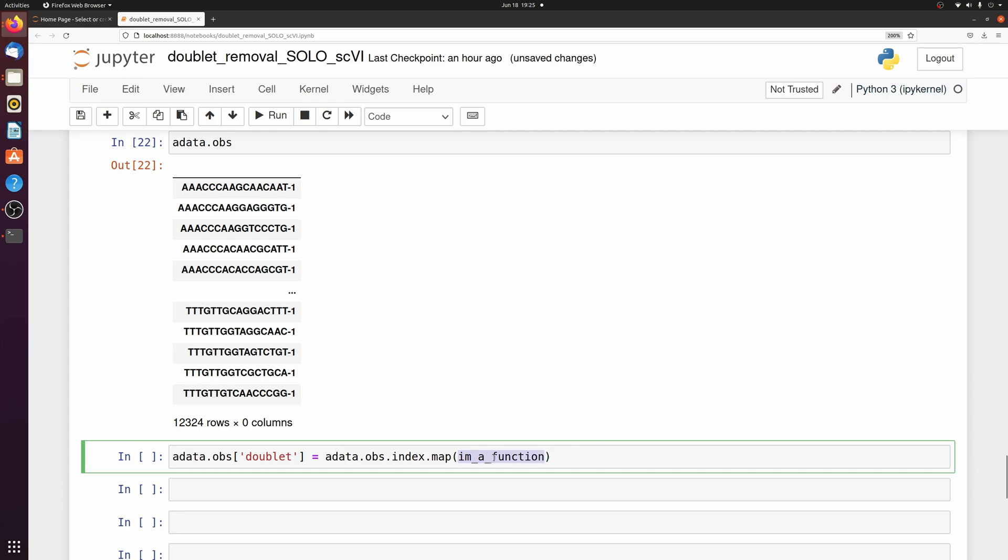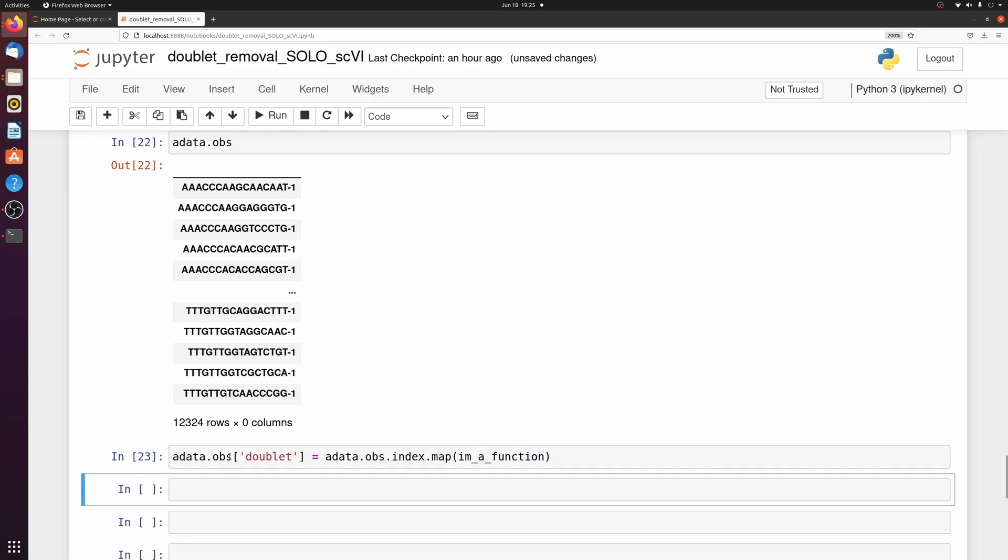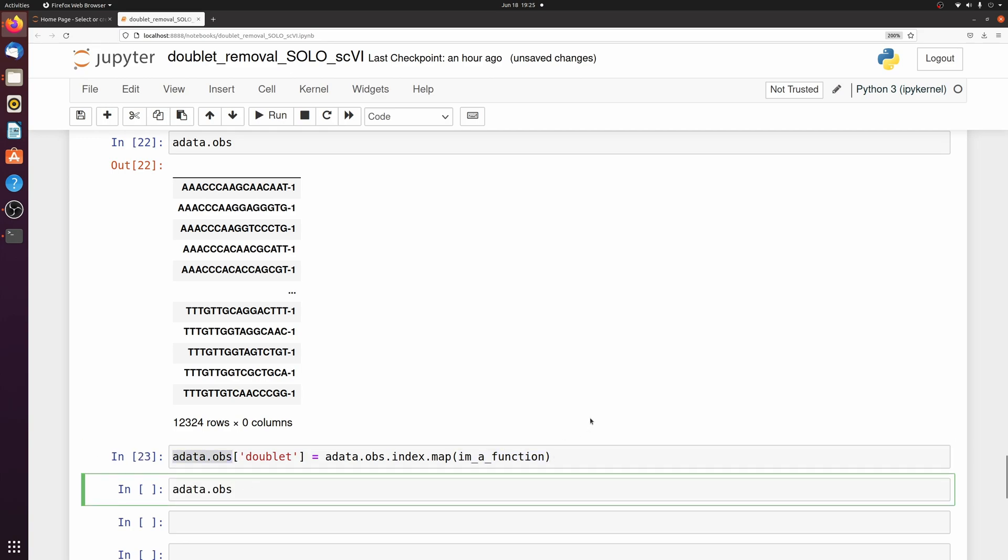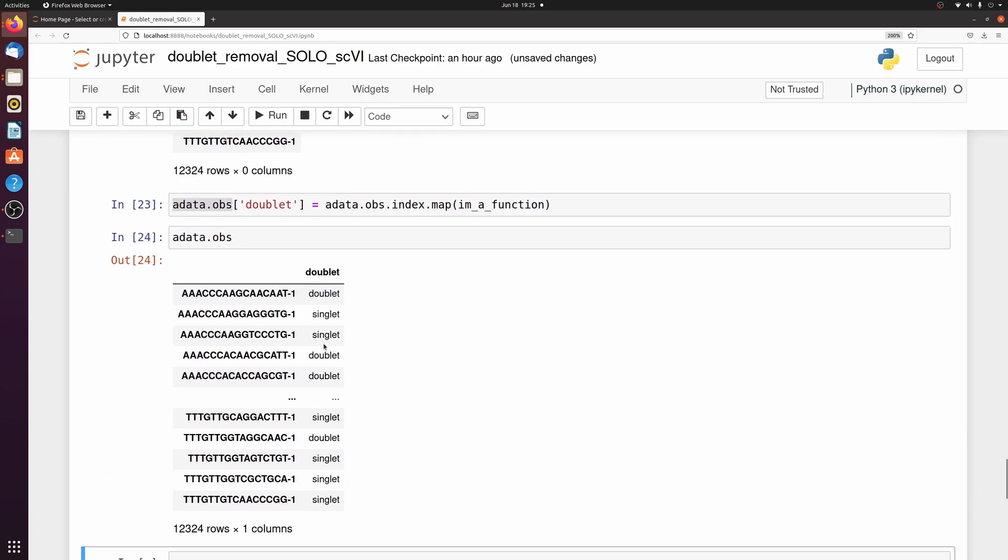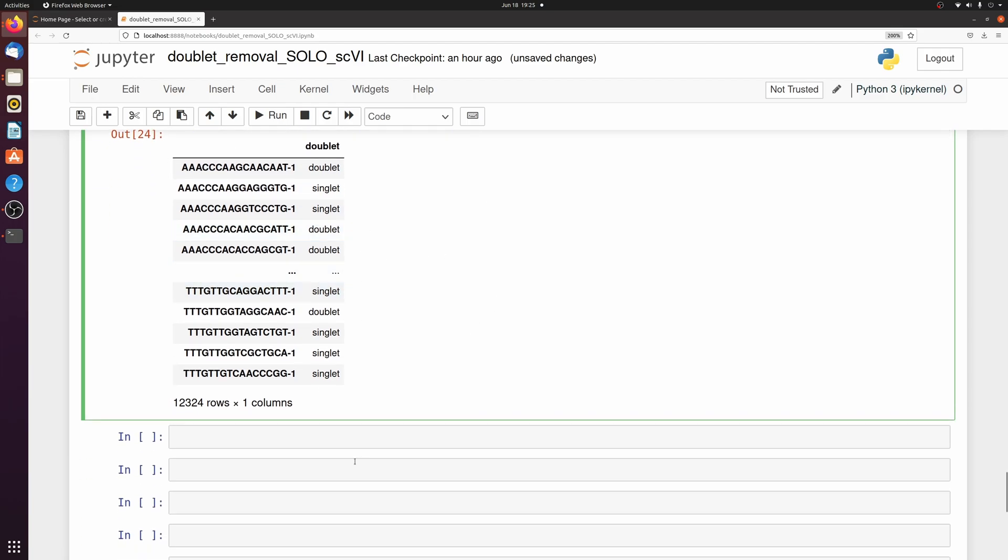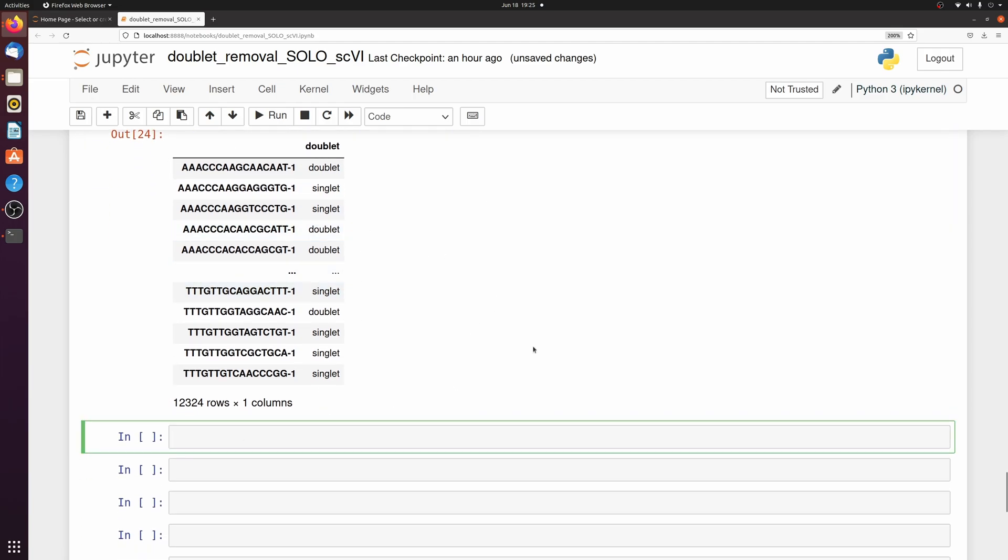And I'm just passing the function which is what I named the function from earlier. So now if we look at adata.obs, we have this doublet column and we can now filter the adata based on this column.